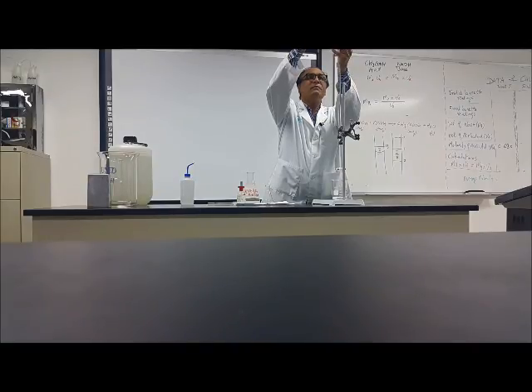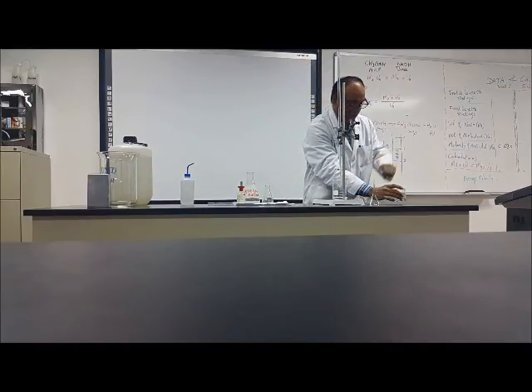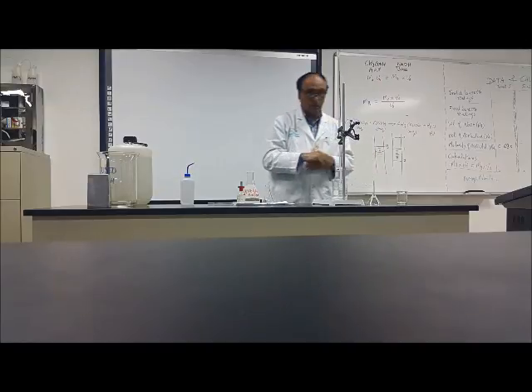Fill it to any mark, above the zero or below the zero. It makes no difference. Keep it on one side. This is sodium hydroxide. It can be above the zero or below the zero, no problem.